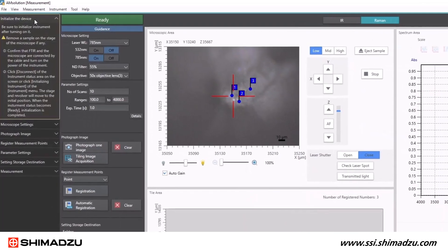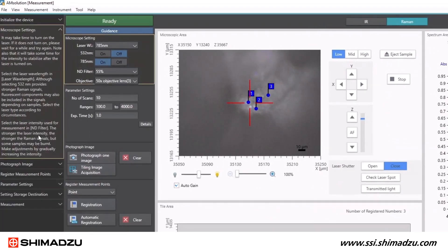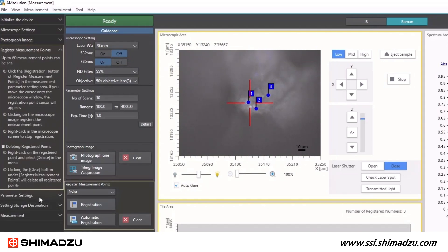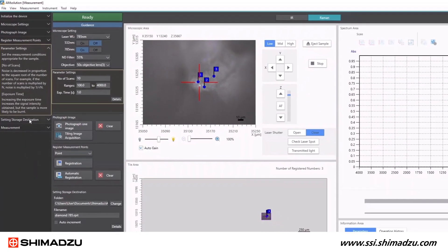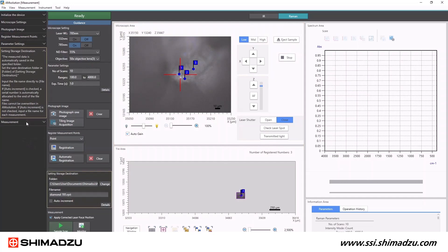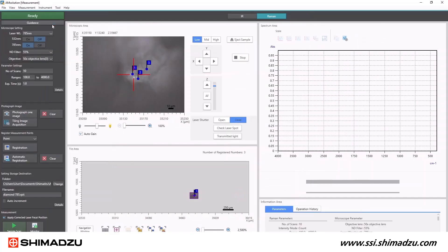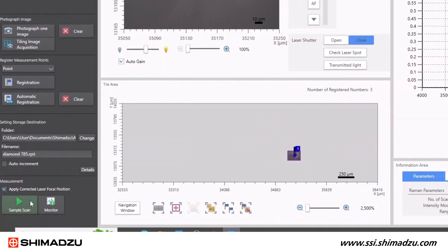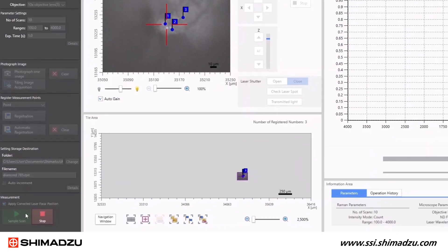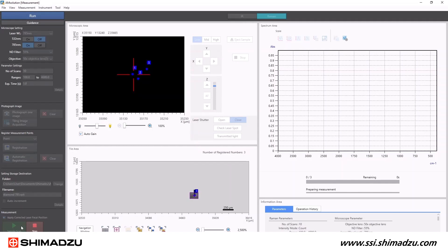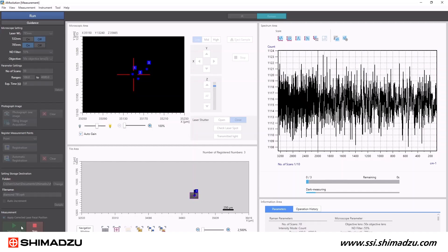The AM Solution software is organized to provide users with an easy workflow. The control parameters are in order from top to bottom with easy to follow guidance instructions. Once your measurements are prepared, simply press sample scans to begin your measurements. The AirSight will move between your background and sample measurement points automatically.